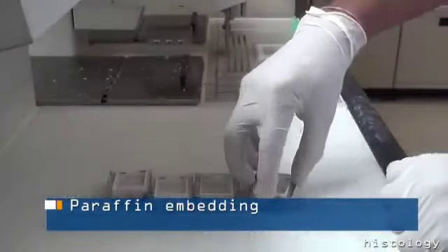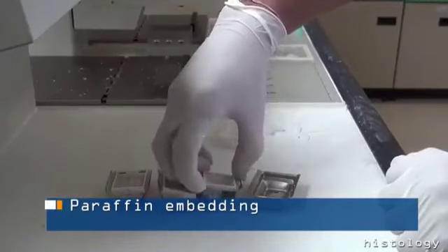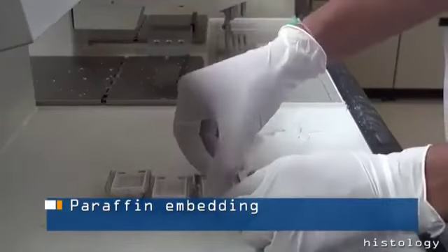Once the paraffin is solid, the entire block, with the cassette, is popped out of the mold, and the block is ready for thin sectioning using a microtome.